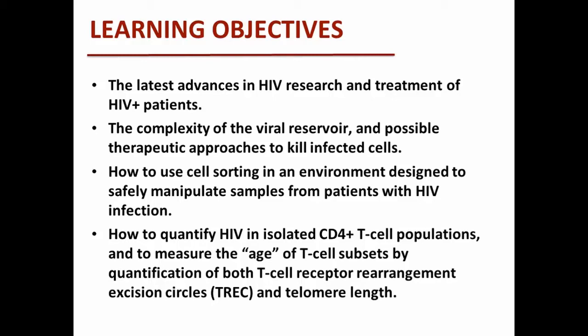I will show you how you can use very sophisticated and new technologies like cell sorting in a special environment which has been designed to manipulate samples from patients with HIV infection, but not only patients with HIV infection.